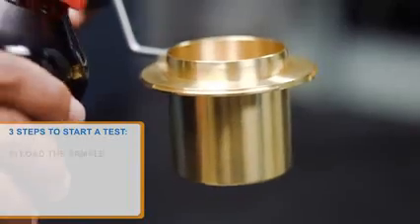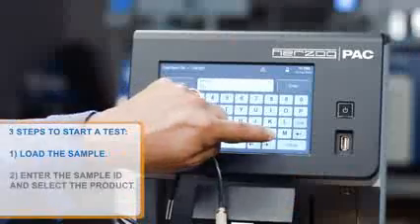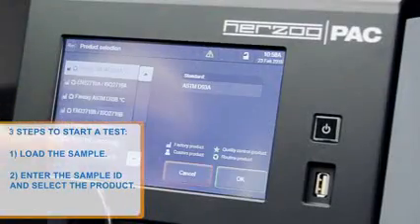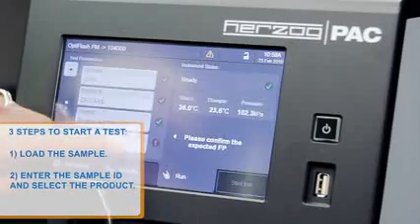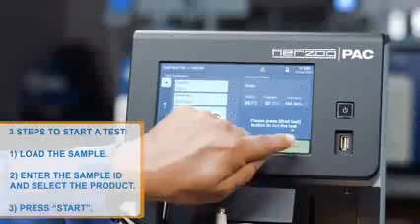With OptiFlash's robust design, technicians can start a test in three easy steps. One, technicians load the sample. Two, the user enters the sample ID and selects the product with the expected flashpoint. Three, all that is left is for the technician to press start.